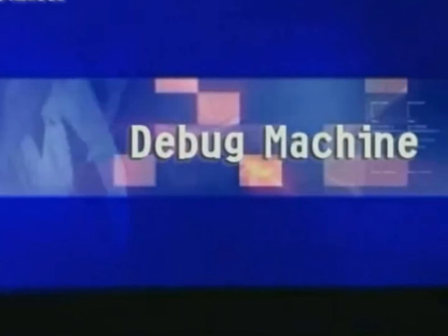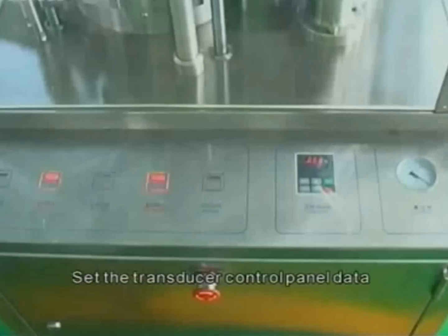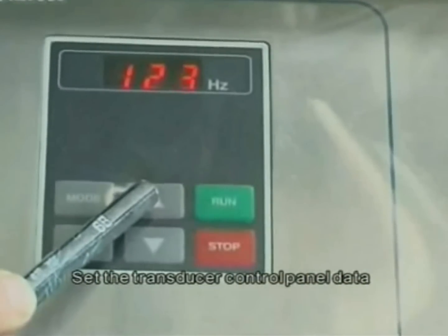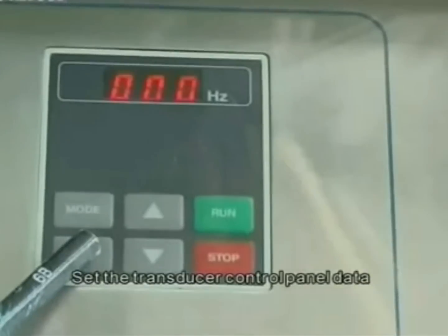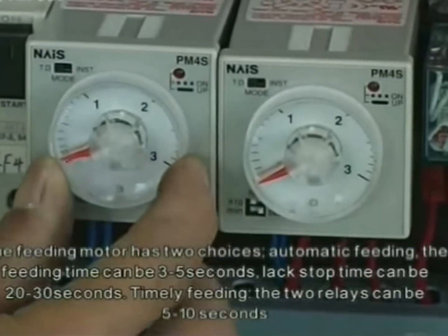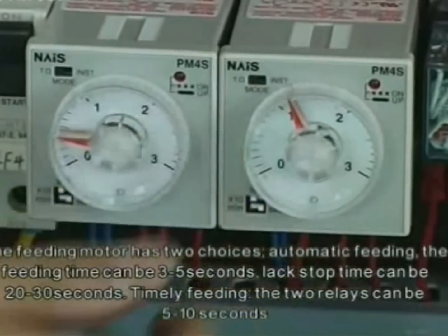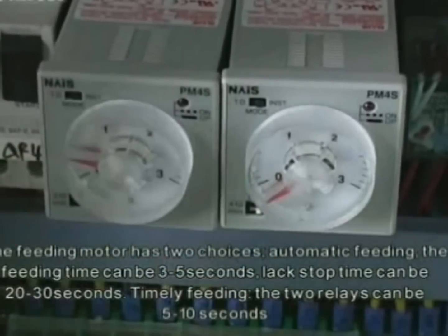Debug machine: set the machine running in debugging state and set the transducer control panel data. The feeding motor has two choices — automatic feeding, where the feeding time can be three to five seconds, and the next interval can be twenty to thirty seconds; or timely feeding, where the two relays can be set to five to ten seconds.